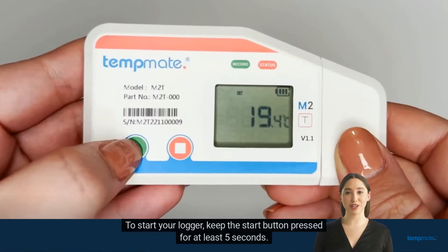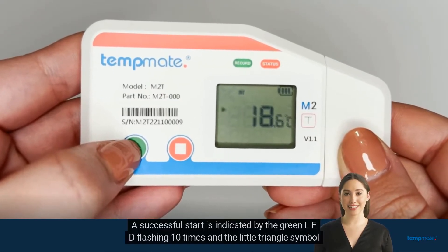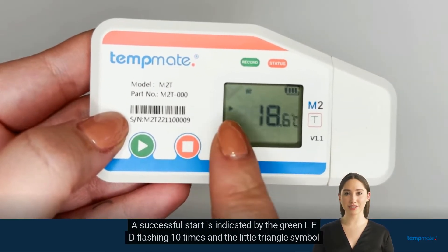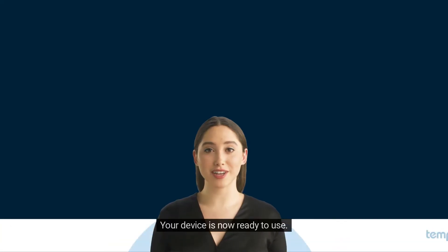To start your logger, keep the start button pressed for at least 5 seconds. A successful start is indicated by the green LED flashing 10 times and the little triangle symbol showing on the display. Your device is now ready to use.